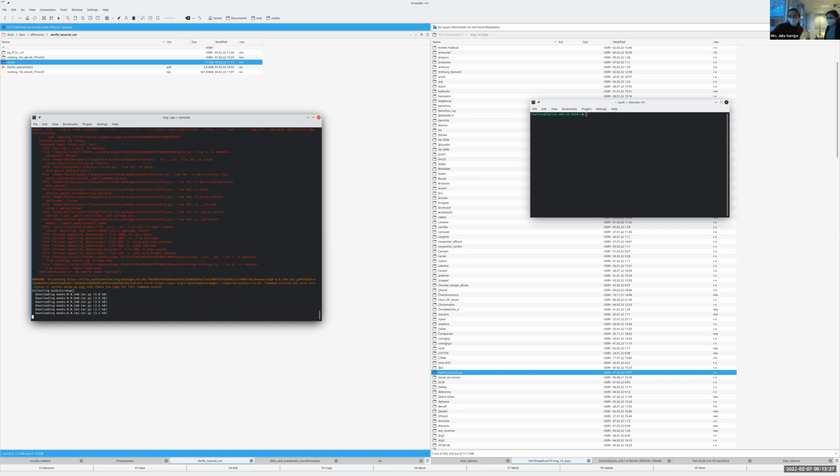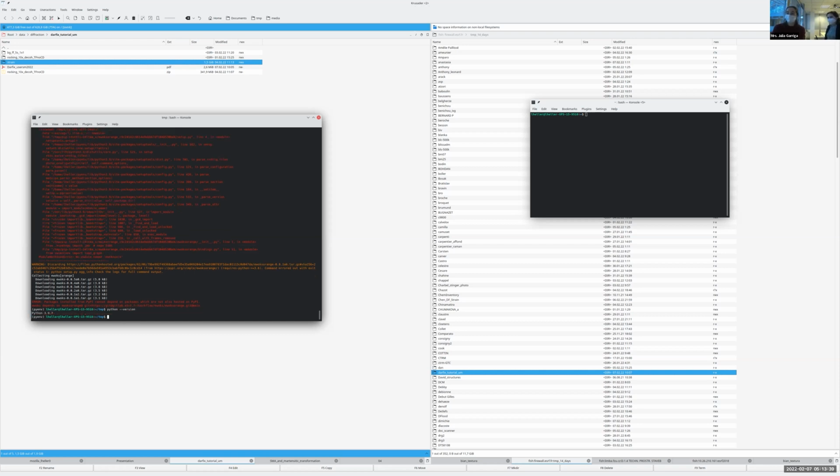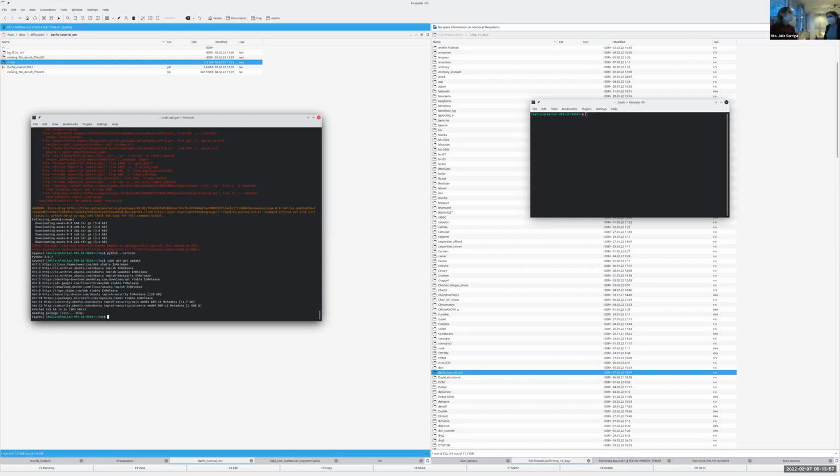Still has some problems. Okay. It looks good. No, it looks good. That's very, very weird. I think, would you do an update of your packages? This is the version of Python. Because I think maybe it needs an update of the Linux packages. Because it doesn't find the packages, yeah, I think maybe it's because of that.